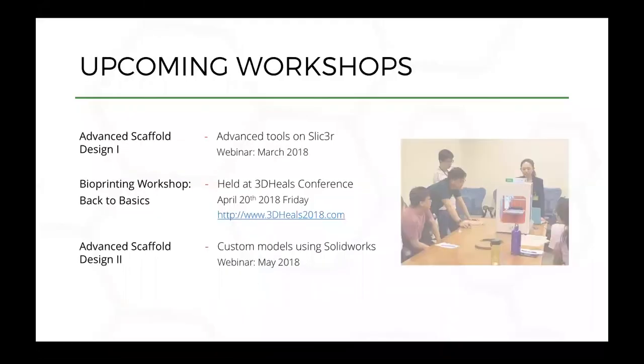We will have more workshops coming up, and the next one that we will do, we'll talk in more detail about Slicer specifically, because when you get into trying to print your own biomaterial with different kinds of viscosity, this is where you really need to learn about Slicer, because that's where we tune and make the adjustments to print with the material that you want.